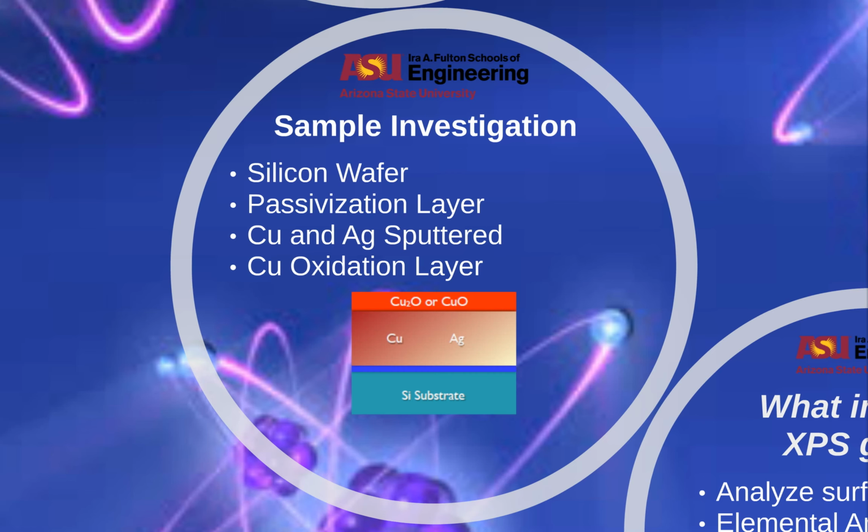What info does XPS give us? XPS allows us to complete elemental analysis on our sample and determine the empirical formula and electronic state of the copper oxide.